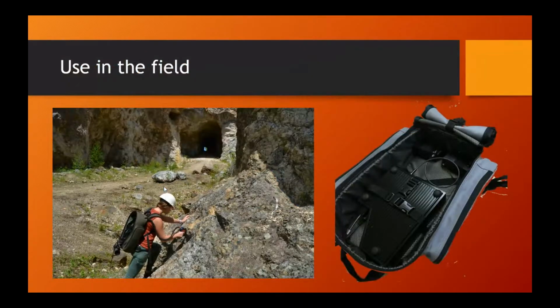All three of the spectrometers are built for both the lab and the field. If you're only working in the lab and have access to power, you can just use a power supply that plugs into a wall outlet. But if you are using this technology for field campaigns, they go into a backpack so that the only thing that you're physically holding is the contact probe. These instruments use lithium-ion batteries in the field for about 8 hours worth of field work.